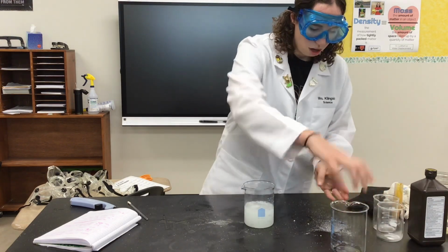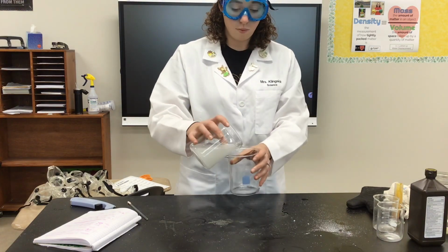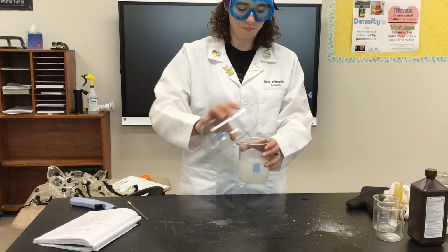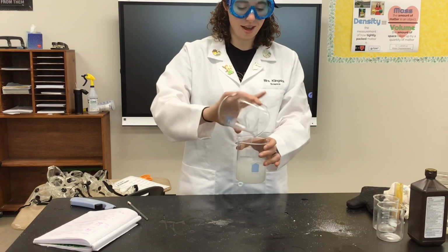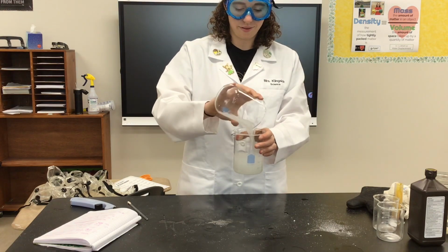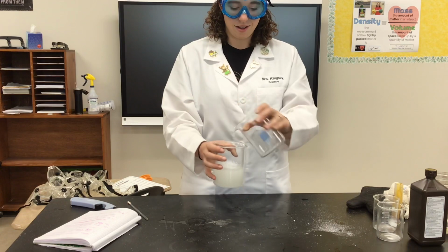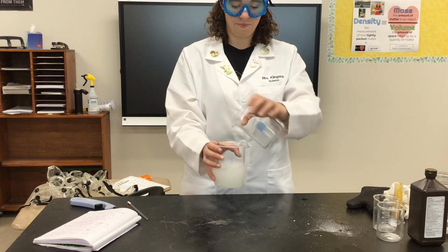Okay, and I'm going to just pour it back and forth. What I'm doing here is giving it some time. Because this is called the iodine clock, we've got to be patient. But I'm also adding in more oxygen. Let's see. I'm hoping there might be a color change, but we'll just have to wait and see. Now, this does take some time, so I might speed up my process here with the editing magic, but keep watching.